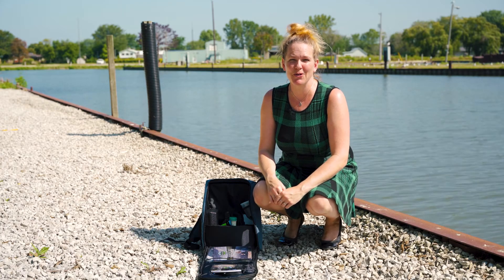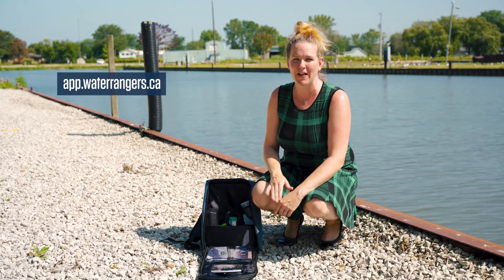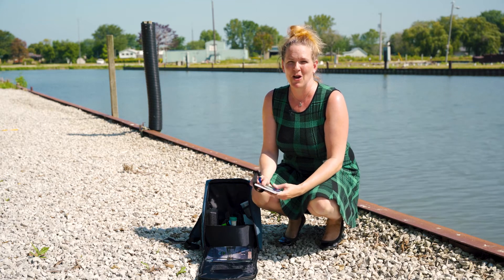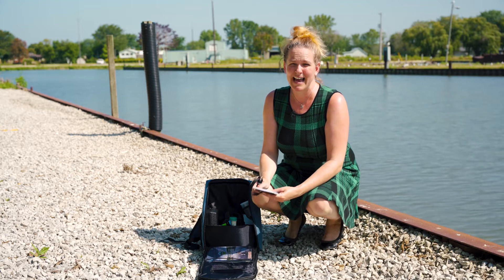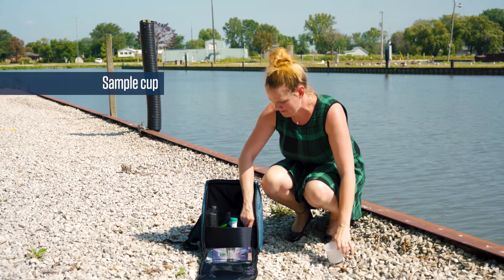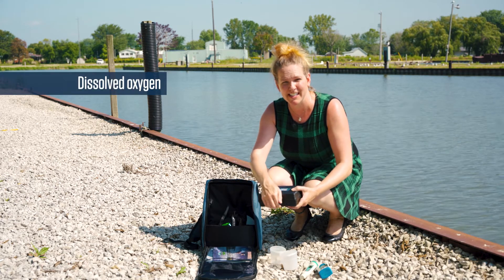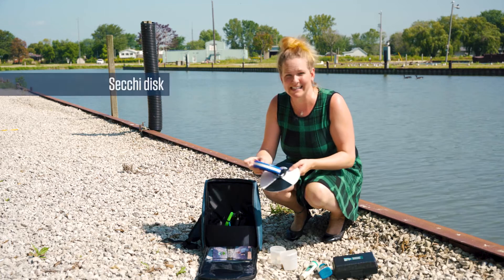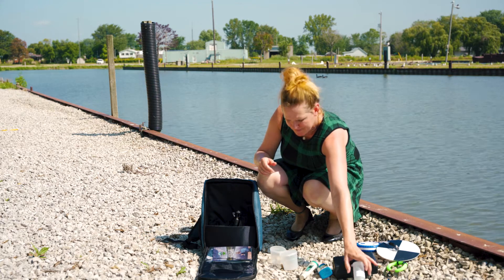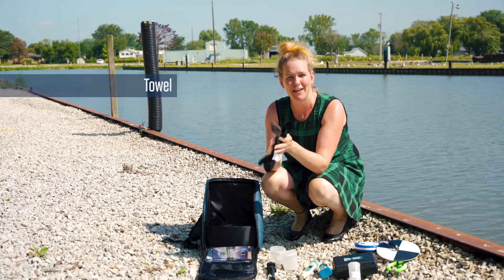We encourage you to record all the information you collect on our website at app.waterrangers.ca. You can do that with our mobile apps, as well as record them on your notepad and then put it on the website when you return home. We also always recommend that you test with a friend. In this kit, we include your main sample cup, as well as a spare one, a conductivity meter, test strips, dissolved oxygen, a Secchi disc, a thermometer with a handle, a disposal cup for your dissolved oxygen, a reacher stick, and a towel to dry everything off before you put it in your kit.